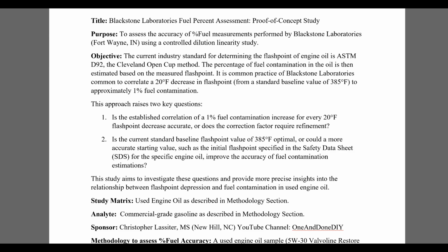Now, with that being said, there's no gold standard here per se between any of these methods, whether it be the Cleveland Open Cup method, which we're going to talk about in a minute, or the FTIR method. So the way that you would figure out what is accurate is that you pressure test their method with known amounts of an analyte.